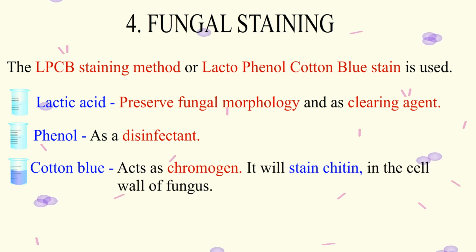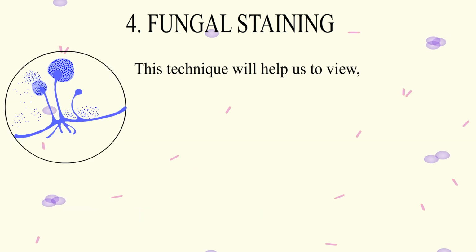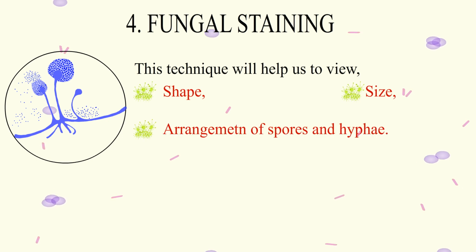It will stain the chitin present in the fungal wall. The dye also contains glycerol, which will prevent the cells from drying. This technique will help us to view the shape, size, and arrangement of spores and hyphae.